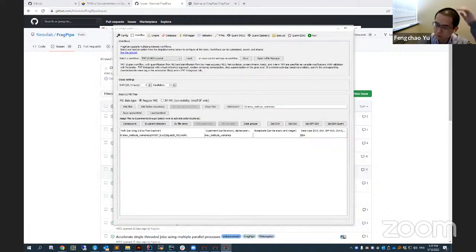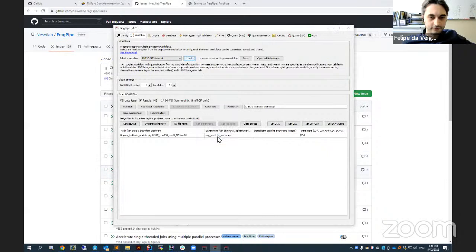Actually, that's a good point, Fengchao. And this serves for everyone that is watching right now and for everyone that is watching on YouTube in the future. If you notice any difference between the version you have right now and what you are showing, that's because we upgraded the programs and we are constantly adding new features and new elements, so you might see differences. There's nothing wrong. It's just because you probably have a different version from what you are showing right now.